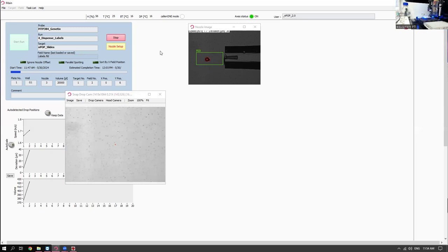Okay, so you can see here essentially going down the columns, dispensing only one of the positions of each cluster. And if you guys want to take a look at it too in the back, I'm only using one of us in that, but you could use both.